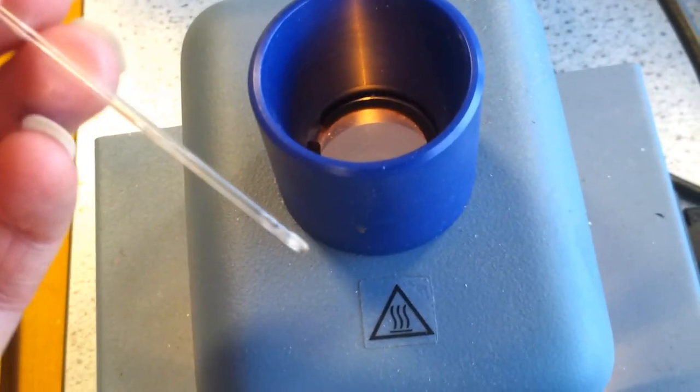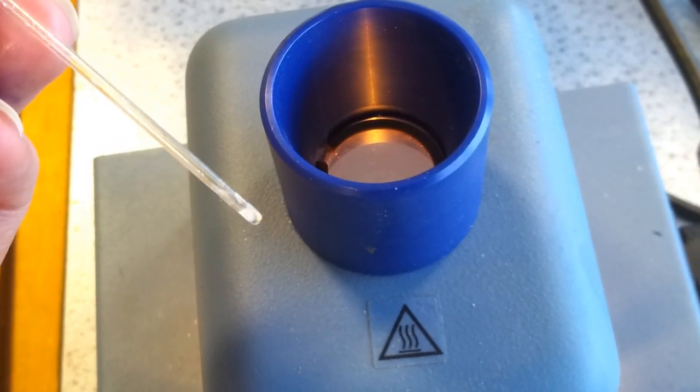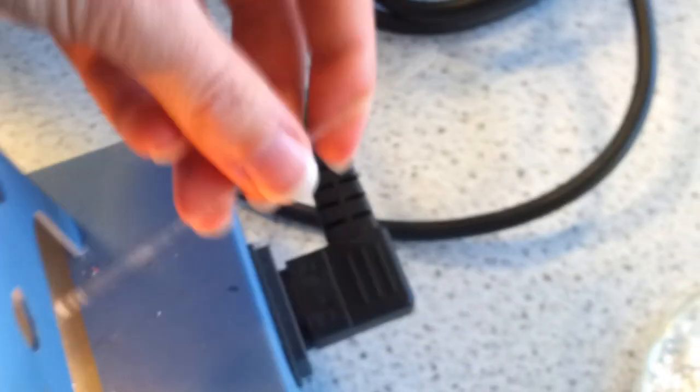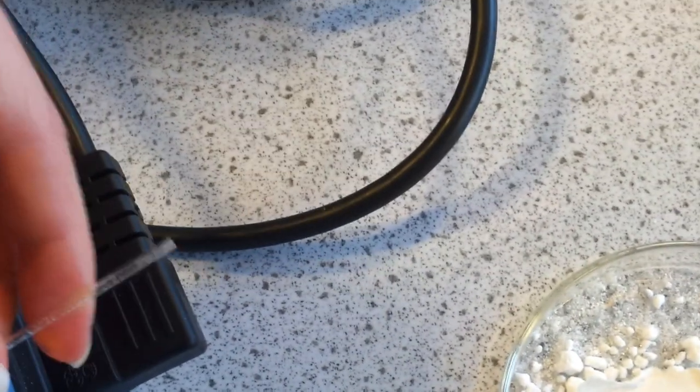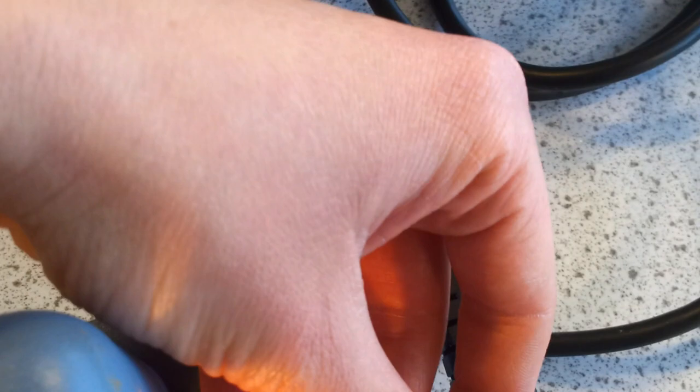So it started melting at 132 degrees, and finished melting at 134. So bearing in mind that pure aspirin has a melting point of 135, ours is slightly impure, because it melted between 132 and 134.